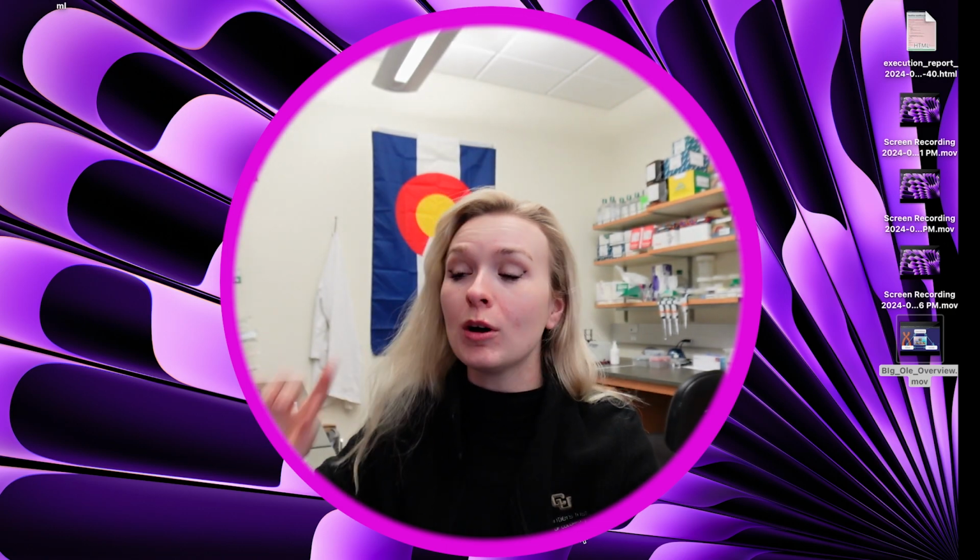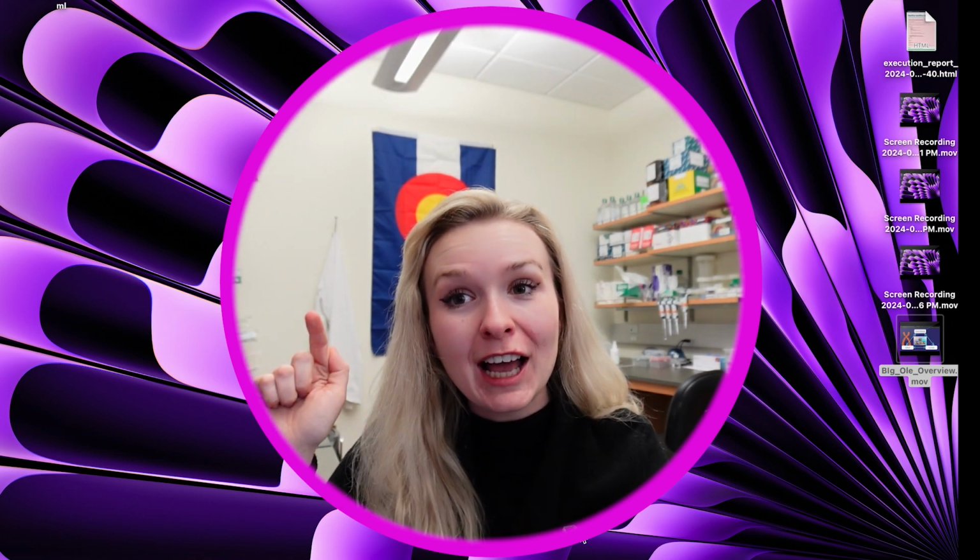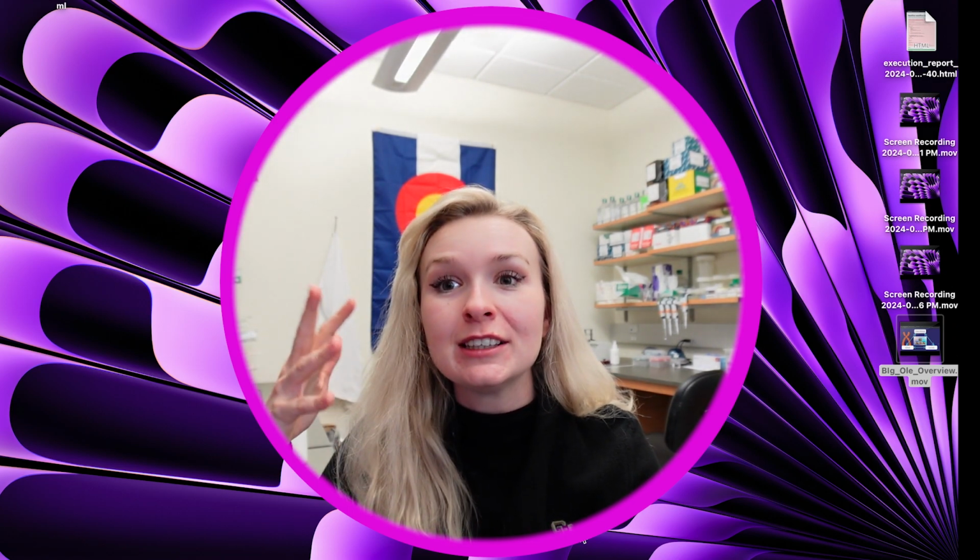I'm Kit, and today we will be talking about how to get the data that you got from running your pipeline. So first and foremost, congratulations, you ran a pipeline and now you have a lot of data to look at. To access that, remember how when we were starting the sbatch and running the pipeline, I was like, make sure you put an output folder and that output folder exists so your data has somewhere to go. So I will be showing you how to access that again.